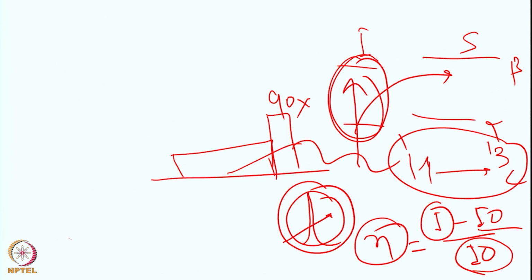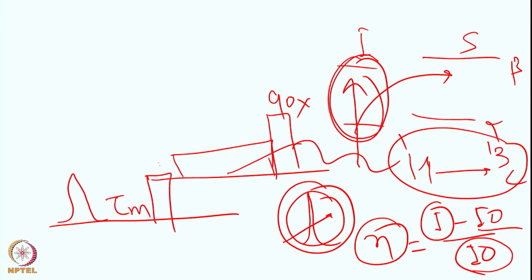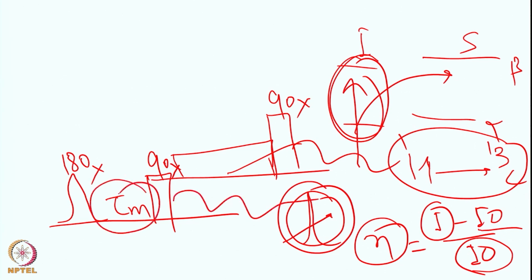Another way to do it is by irradiating with a soft pulse, then allowing time for mixing the spins, then applying a 90 degree X pulse, this was a 180 degree X pulse, and then measuring the FID. Here, if we vary the mixing time, we can actually quantify the distance between two spins in this transient NOE, because this gives you an estimate of how far your perturbation effect is moving.